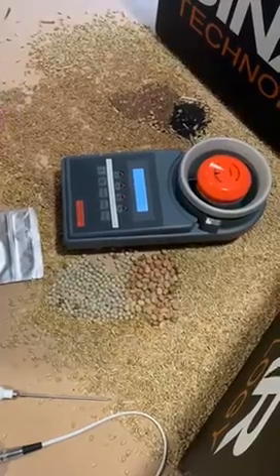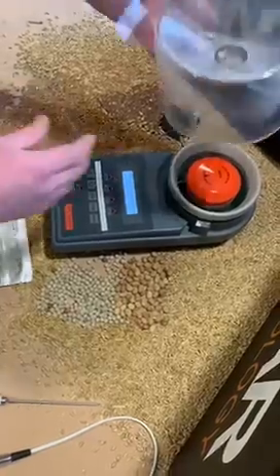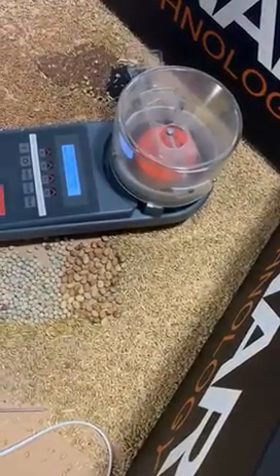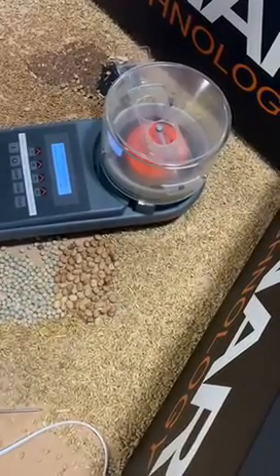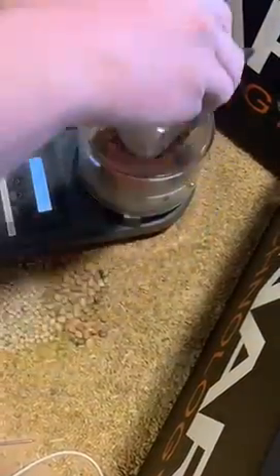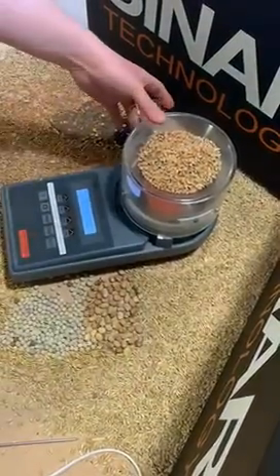Once that's done, that timer will start to count down and this is when we need to add in our sample. Using a hopper, place it on top and place in the sample. Release the hopper.